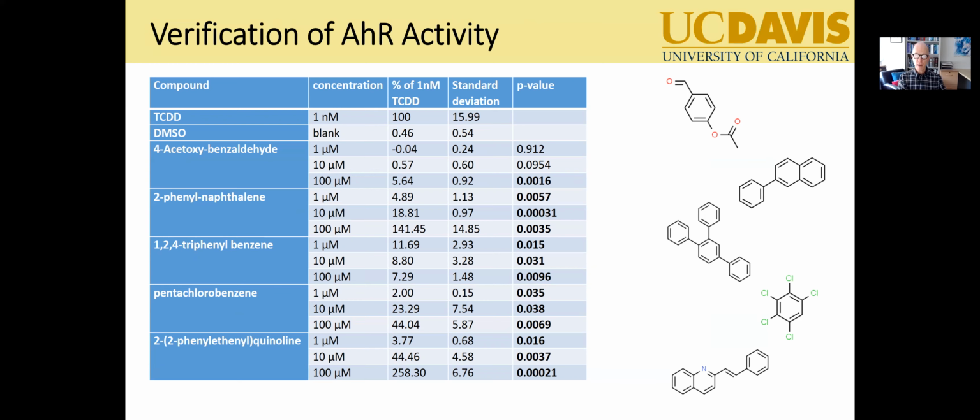And so what we confirmed was that this technique, this relationship of non-target features to bioassay results that we obtain on whole samples, these samples weren't fractionated in any way, they were just tested straight up on the assays.